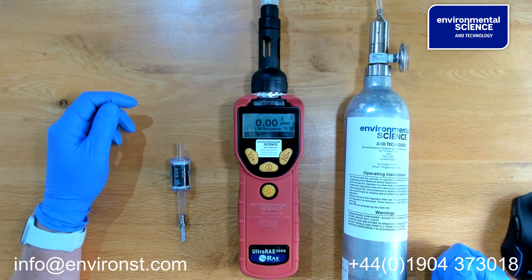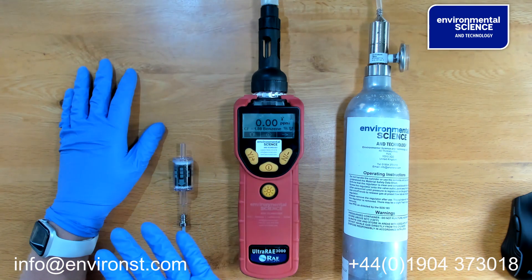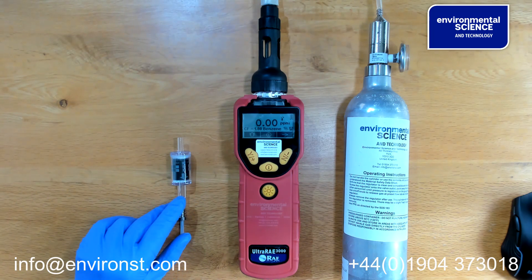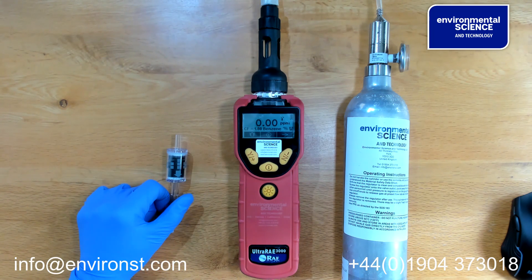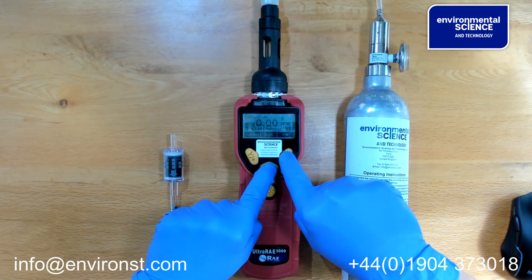To calibrate the Ultra Ray 3000, you will need three components: calibration gas, an Ultra Ray, and a zero filter or a zeroing gas of some description. To enter the calibration menu, you press power.